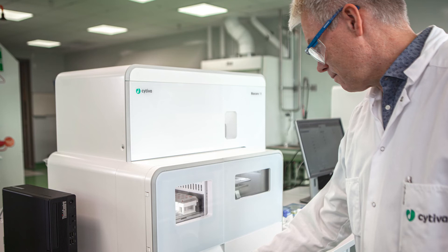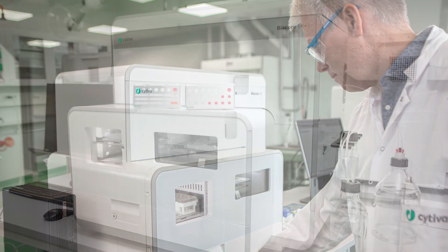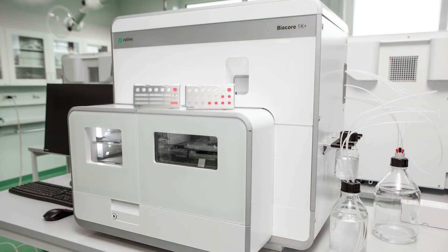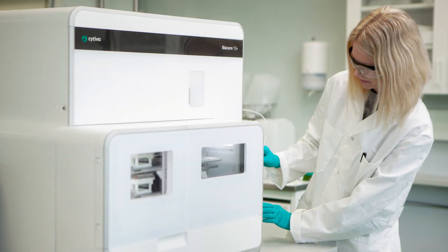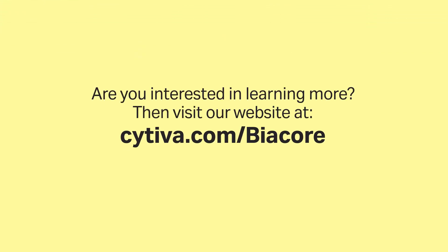Biacore 1 series is our most flexible SPR system platform for use across a wide range of applications and molecules. It handles both pure samples as well as complex ones, ranging from small fragments to large viruses. Are you interested in learning more? Visit our website at cytiva.com/Biacore. Thank you and bye!